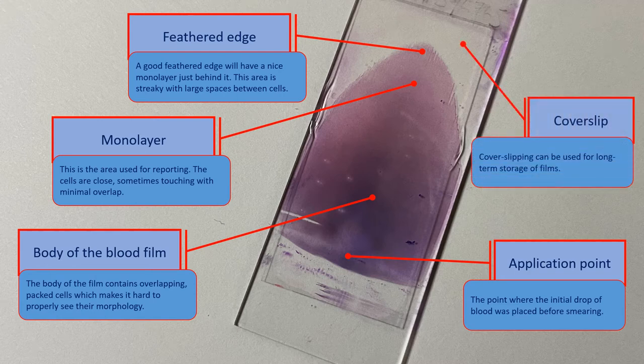As can be seen, this particular blood film is cover slipped. However, the cover slip doesn't cover the entirety of the blood film, and some of the stained parts are outside the covered area.